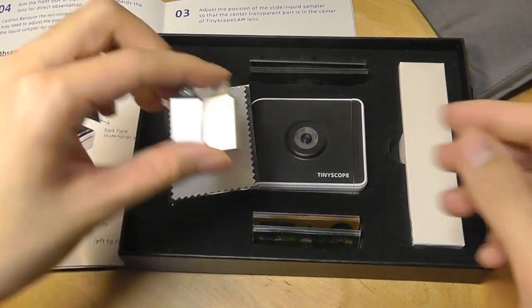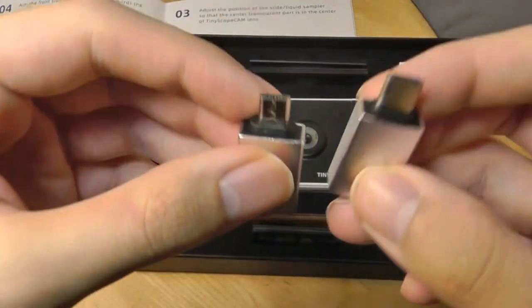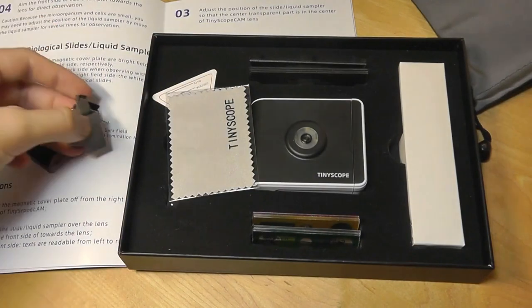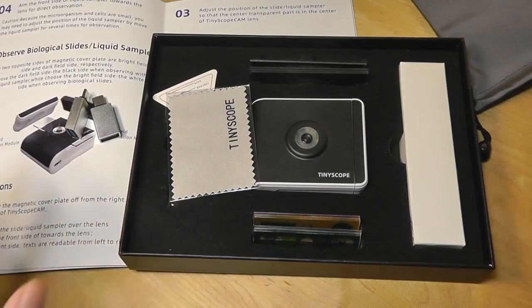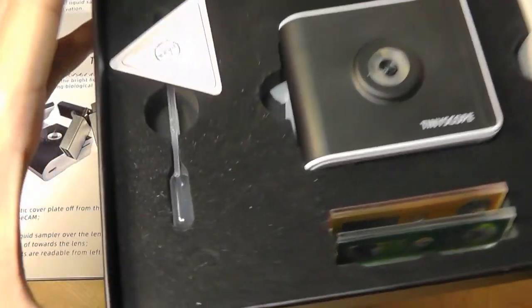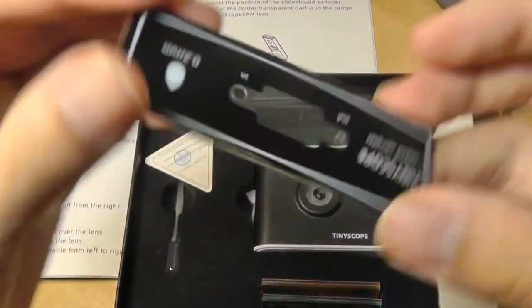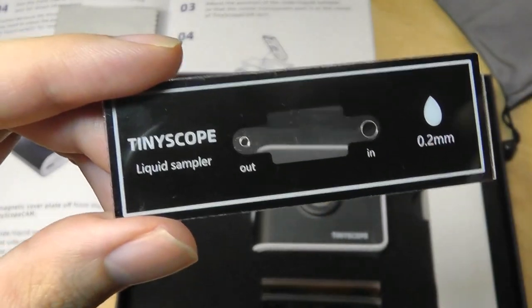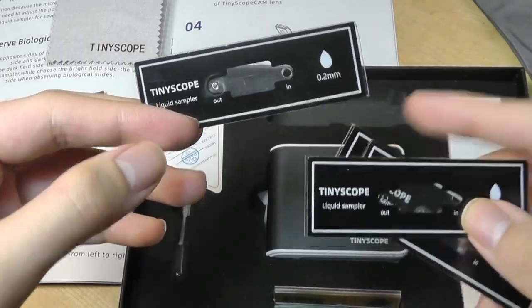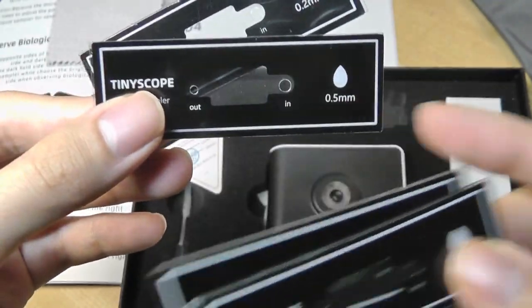We also get two adapters, which you can use to plug into your smartphone if it supports OTG. You want to use it in the wired mode — it's both for micro USB and for USB Type-C. For iOS devices that have a lightning port, you have to use the Wi-Fi wireless connection mode. There's also a microfiber cleaning cloth for the lens, and over here we have a pipette that you can use to drop liquid samples onto the included plates, which have a small hole to drop the liquid sample in, and this is the side it comes out from after cleaning.